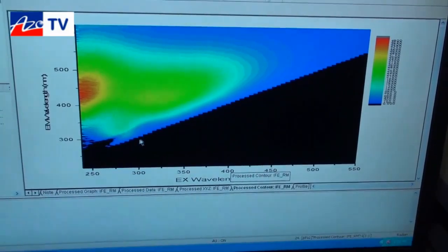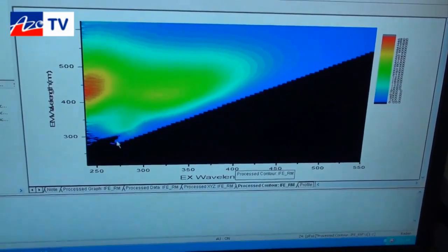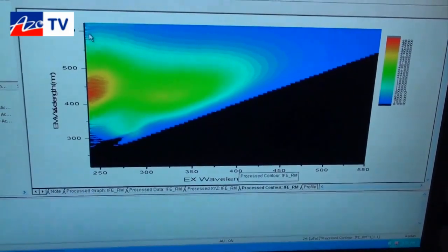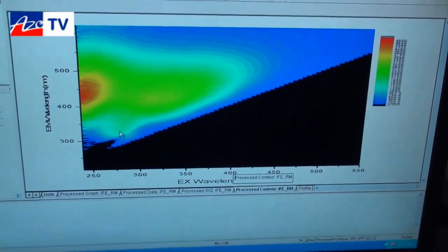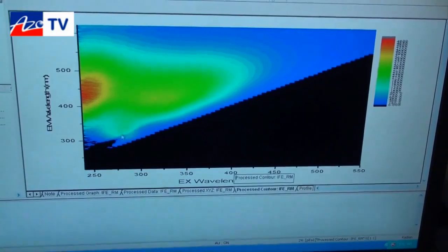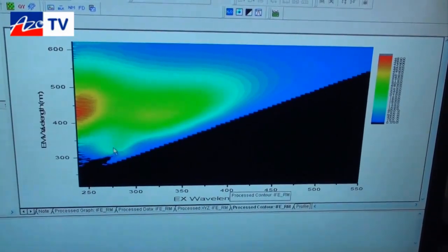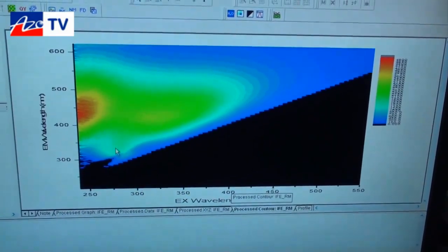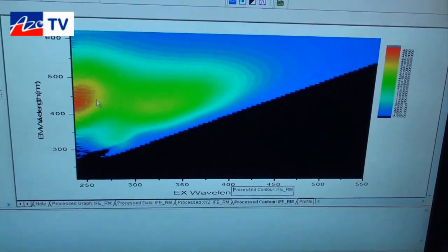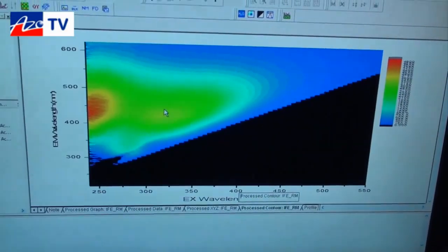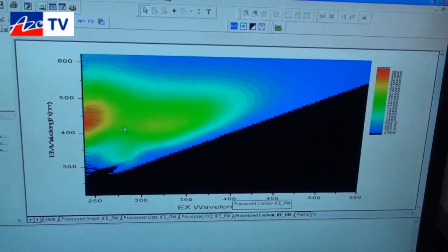This being the fully corrected spectrum where we've removed the overlapping regions of the excitation and emission detectors and we've corrected for the inner filter reabsorption effect. So this is the true profile of the composition of the material. This particular sample is noted for containing aromatic peptide residues or amino acid residues like tryptophan as well as fulvic acid. The main component that you see here is the fulvic acid component which is from the breakdown of plants and animal materials in the soil and it gets into the water stream.